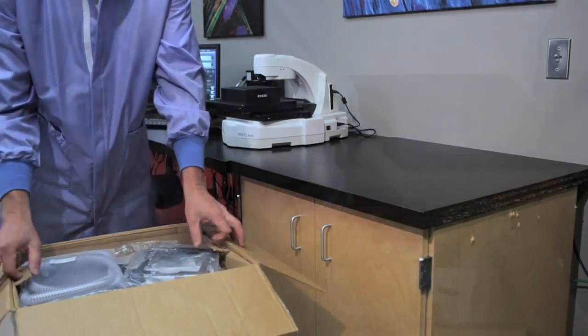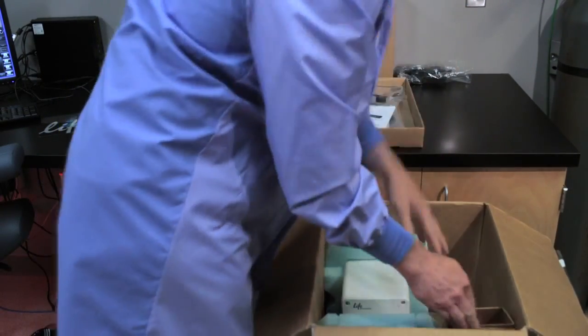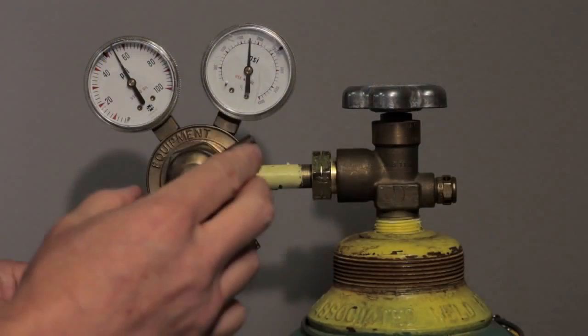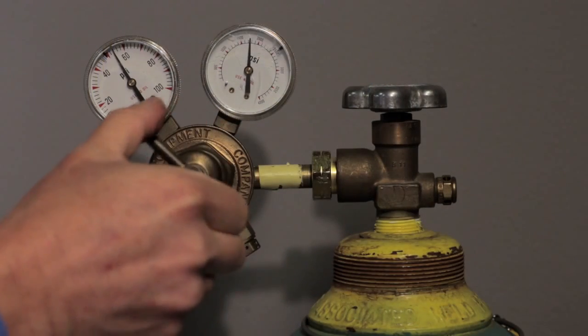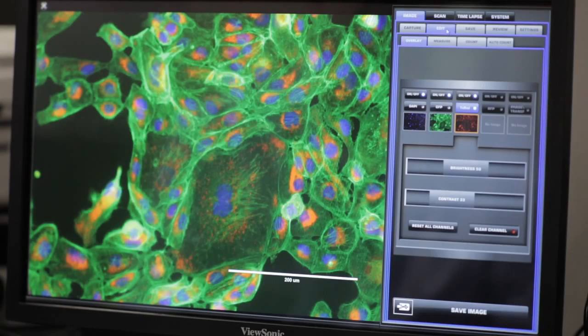This video will provide a step-by-step guide to connecting the On-Stage Incubator to your EVOS FL Auto System. Prior to starting, the following materials will be needed: a CO2 tank and compressed air with regulators, and cells for bright-field or fluorescence microscopy.